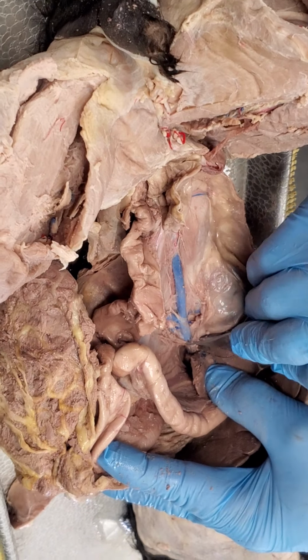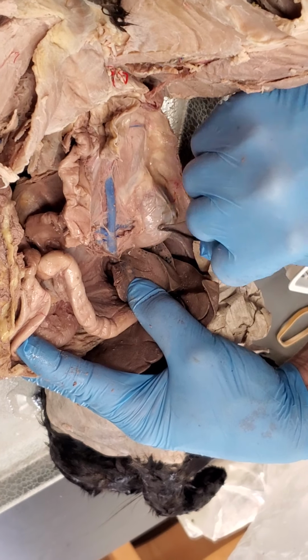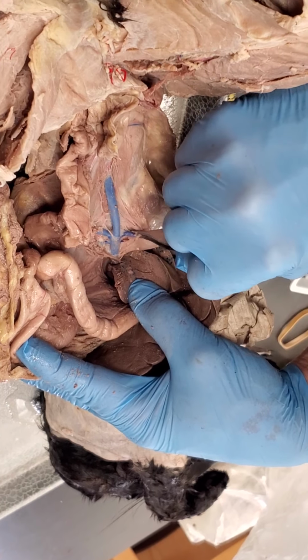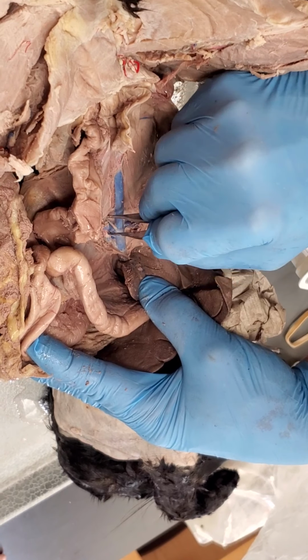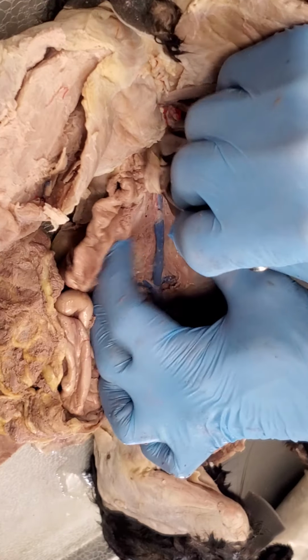All right, so here's the inferior vena cava coming kind of through the liver. Liver wraps around it. You got a kidney here, so that's a branch coming from the kidney. That's a right renal vein, left renal vein. Then the only other thing is, go down here, go down here.